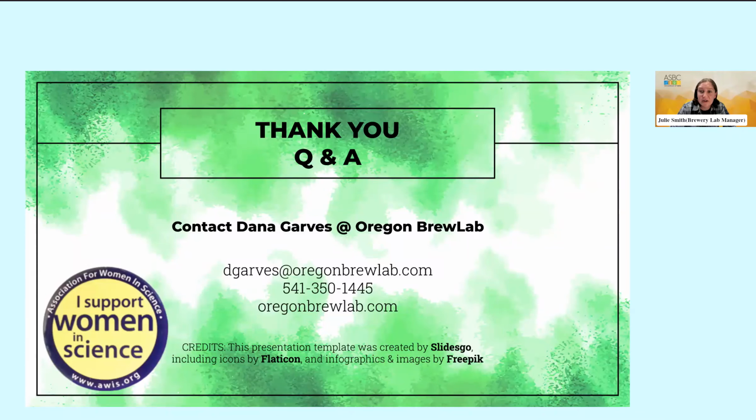Awesome. What is your source for glass media plates and centrifuge tubes? Amazon, actually. But I'm pretty sure, I don't think Weber Scientific has the centrifuge tubes, but they do have the Petri dishes.